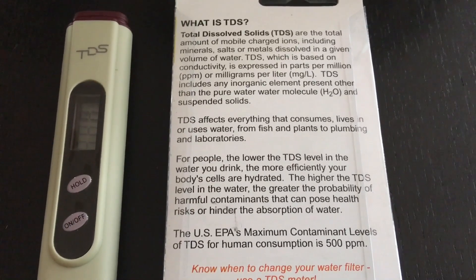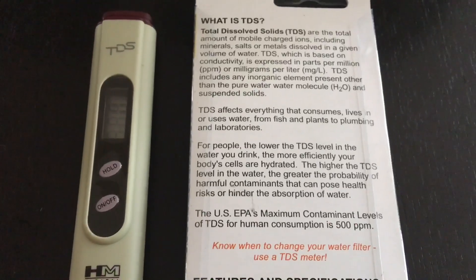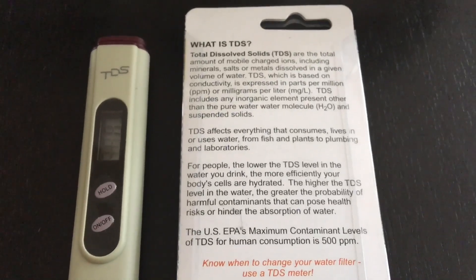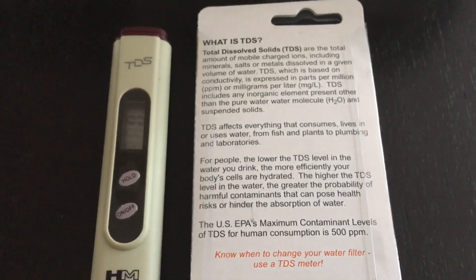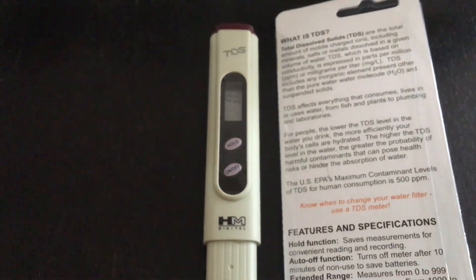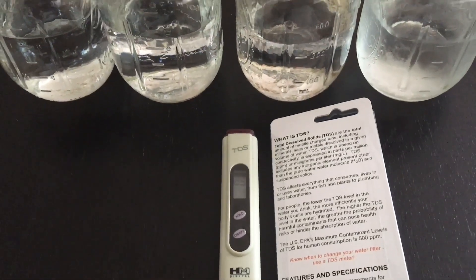The objective when testing water is to ensure that the TDS reading is as close to zero — if not at zero — as possible. I was very eager, like a tech junkie, to go ahead and test out this TDS meter.